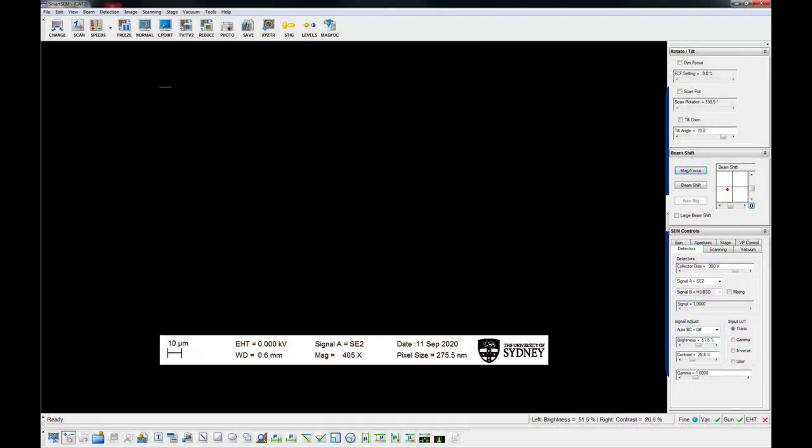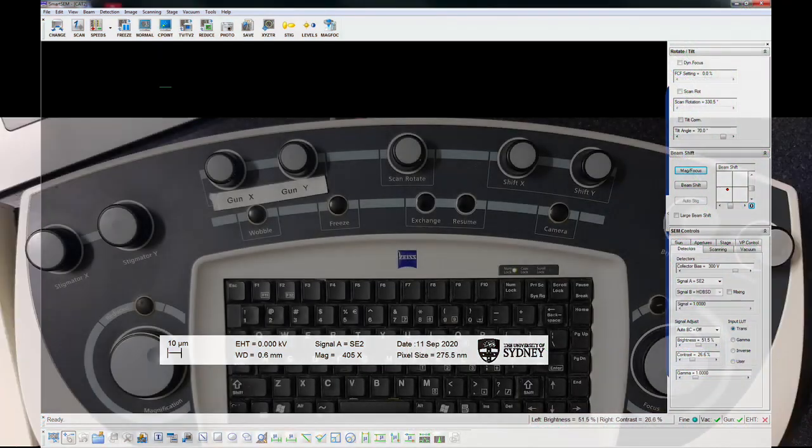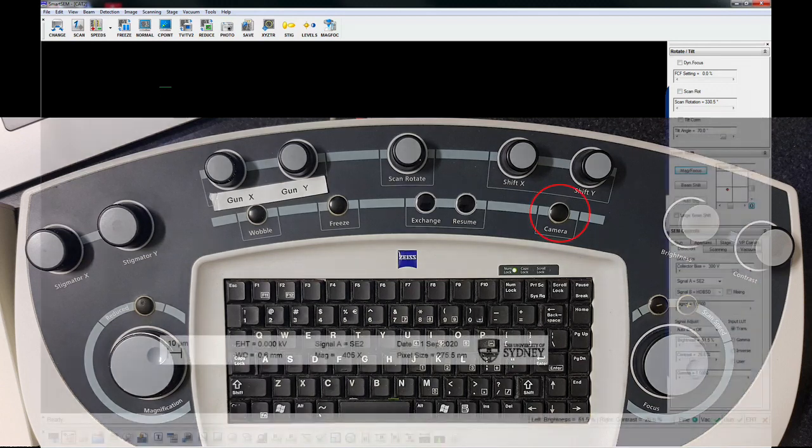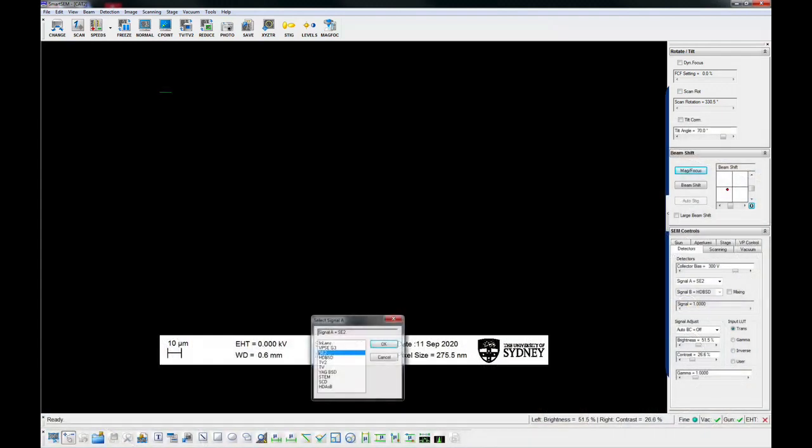On the microscope PC, check to see if the chamber view is visible. If not, press camera on the control panel, or double click the detector on the screen and select TV.